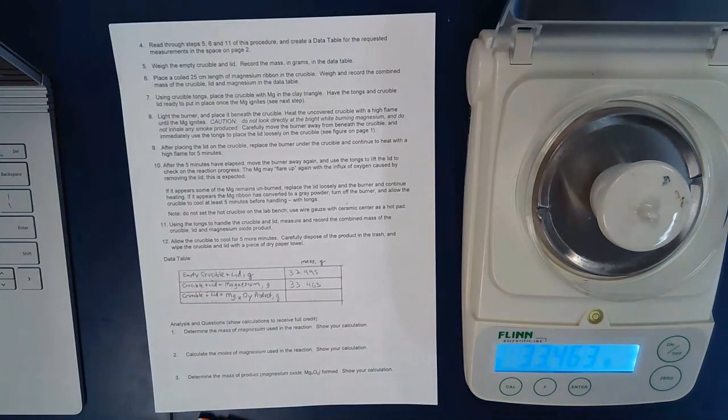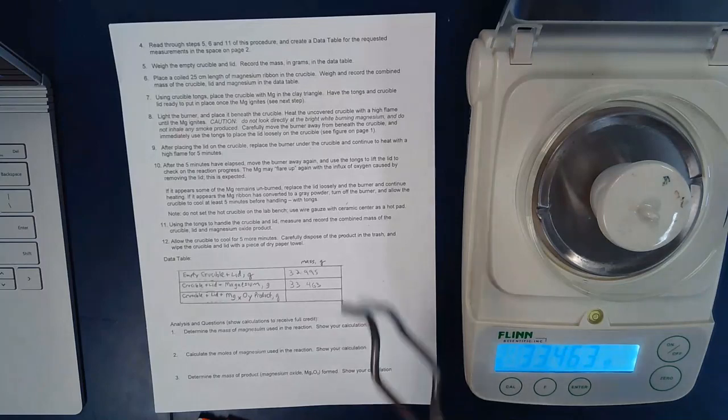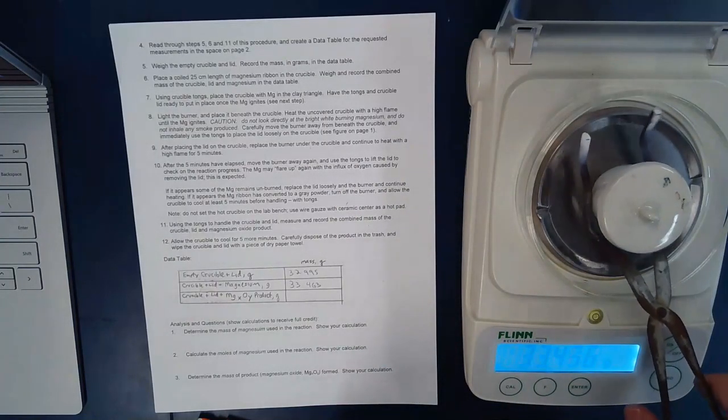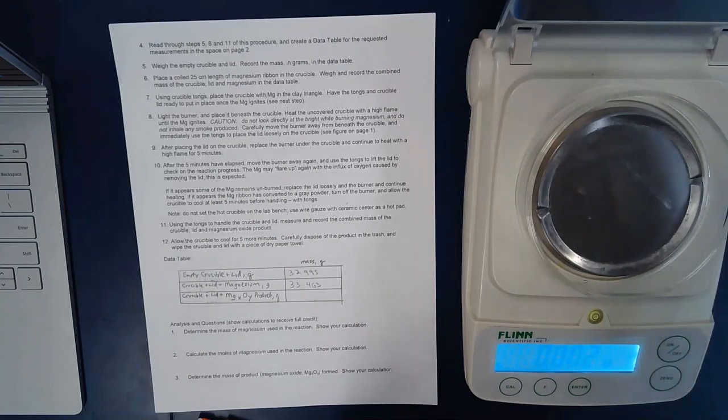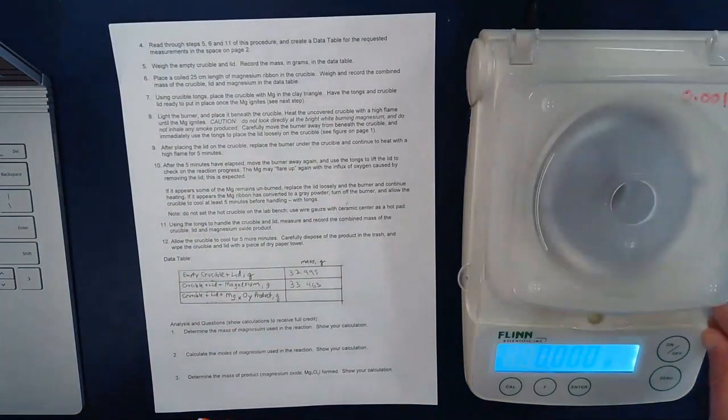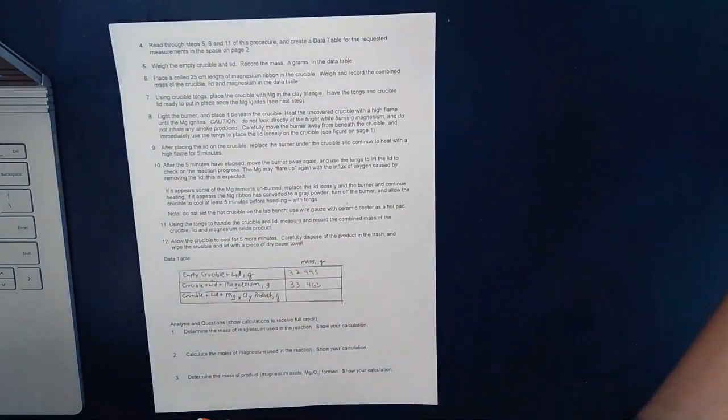So, at this point, we're ready to start heating the crucible. One thing, we're going to use these tools. These are crucible tongs. They move the crucible carefully. Crucibles get hot. And so I'm going to put it over here, and we are going to change the view so that you can see what's going on.